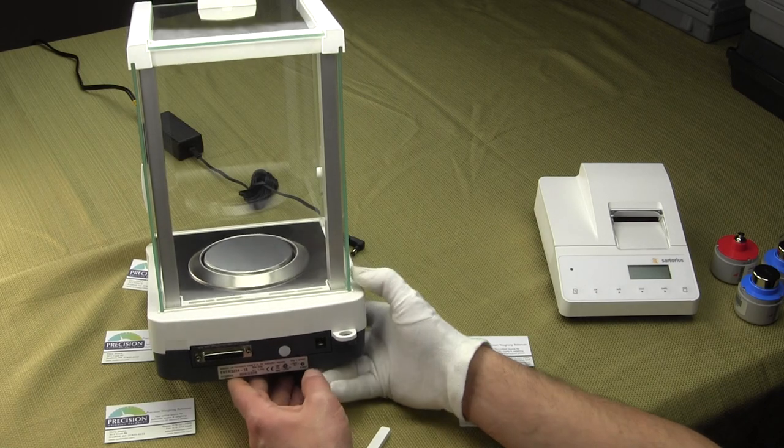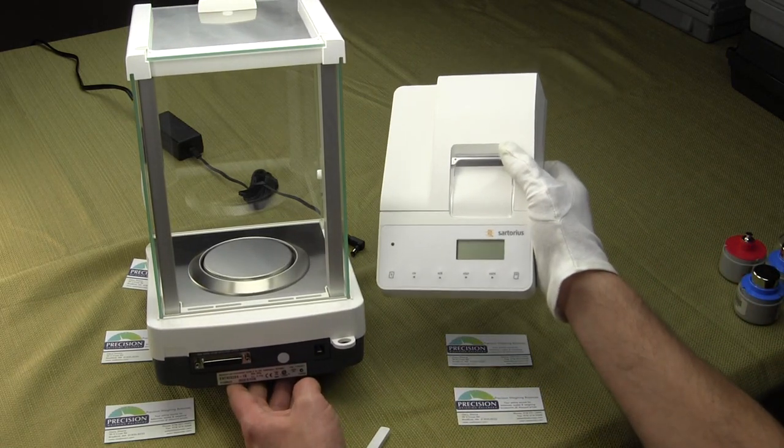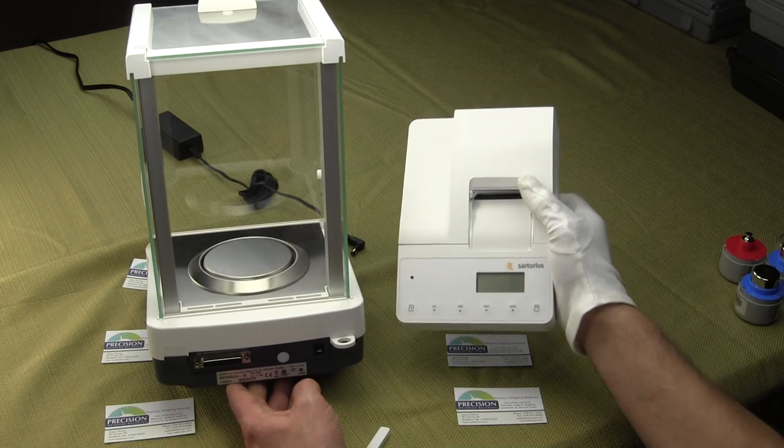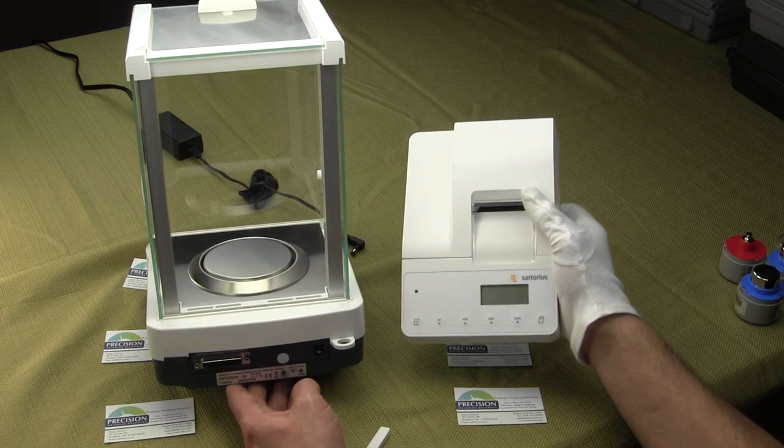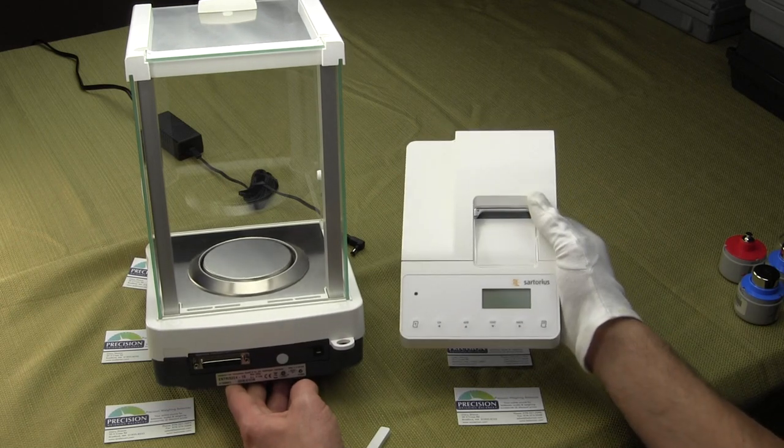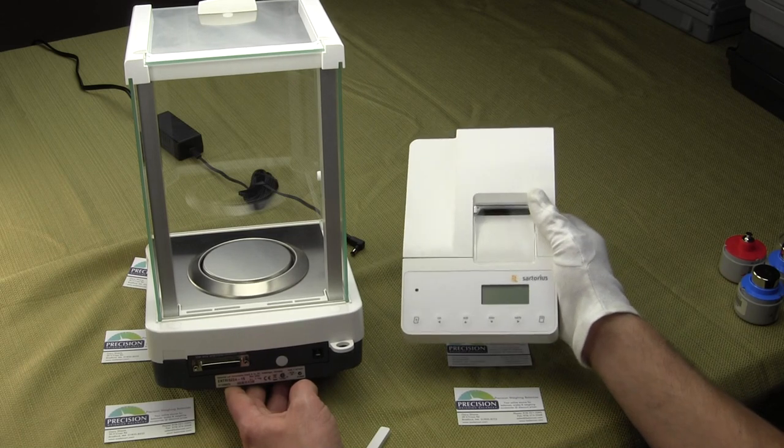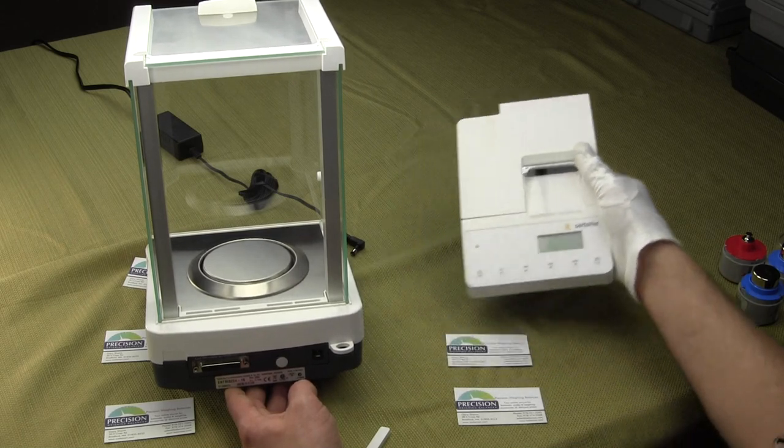On the rear of the balance, we have a 25-pin serial interface. This would be used if you wanted to connect the balance to an optional Sartorius YDP-20 printer, which we also offer. If you're required to be GLP compliant, you need traceable paperwork on what you're actually weighing. It would record the date, the time, the serial number of the unit, along with the weight.